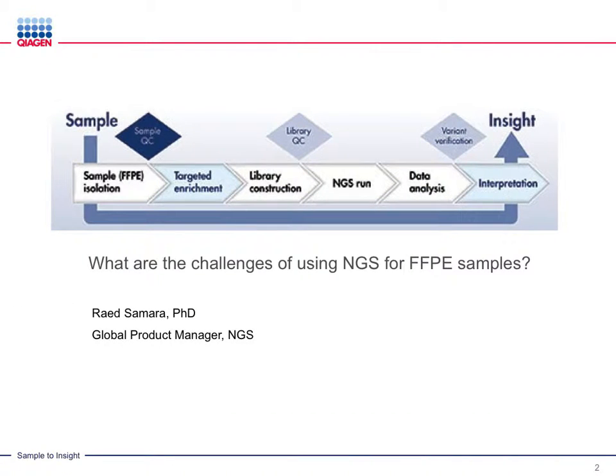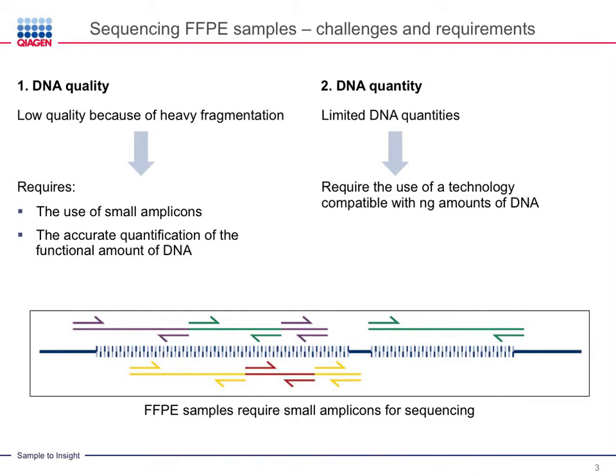Today's question: what are the challenges of using NGS for FFPE samples? While FFPE samples contain a wealth of information for the molecular characterization of diseases, especially cancer, two main challenges still exist for the NGS analysis of DNA extracted from FFPE samples: DNA quality and DNA quantity.